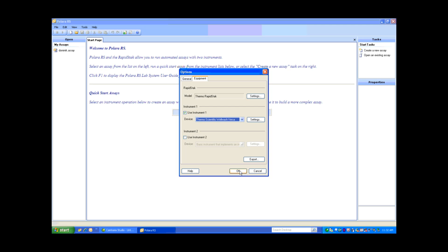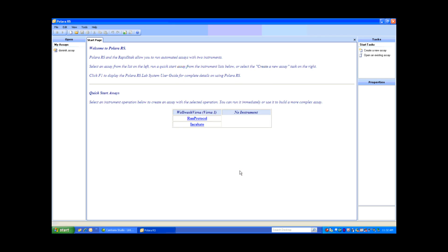Back in Options, I'll select OK, and you'll see that the WellWash Versa has been added to my system. I can add another instrument, but for now I'm just going to run the Versa.